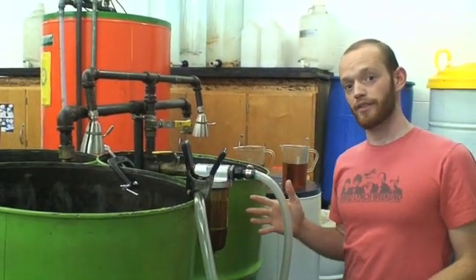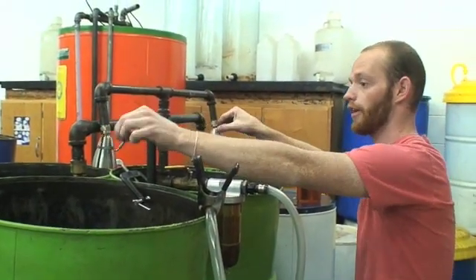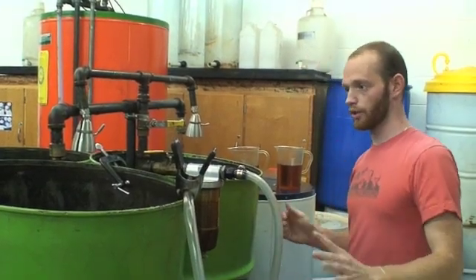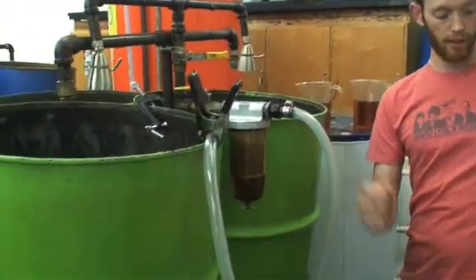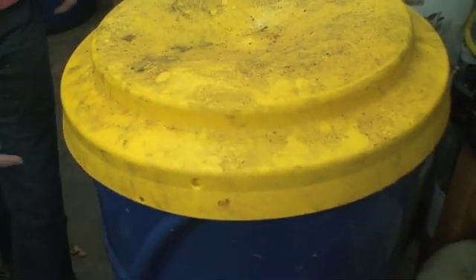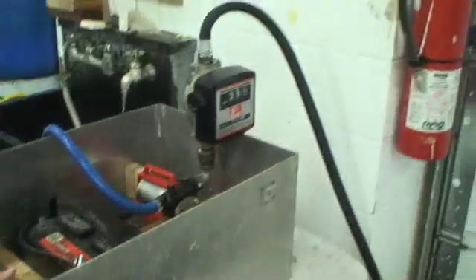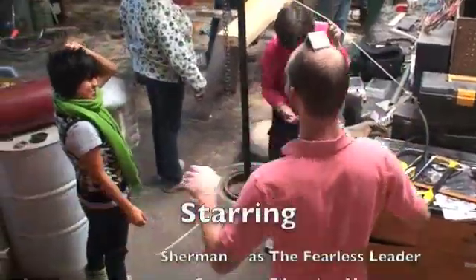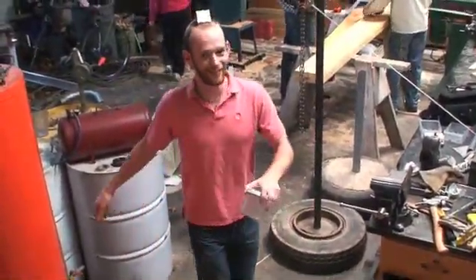There's just a little extra water left over, so we heat up the oil again and bring it through these two faucets to allow all the biodiesel to evaporate any remaining water. Then it's ready to be filtered one last time and entered into the storage container, which is also hooked up to a pumping station allowing us to service any vehicles that come up close to the building. It has a nice gauge for gallons — and that's in summation what takes place.